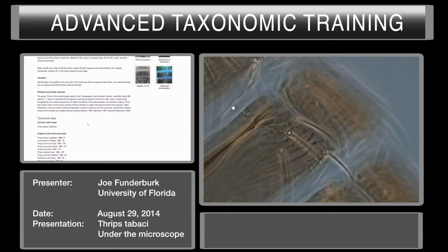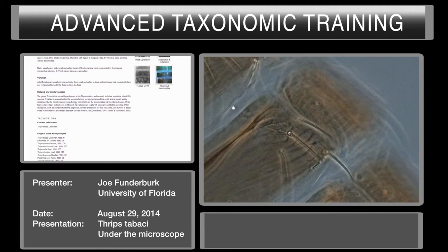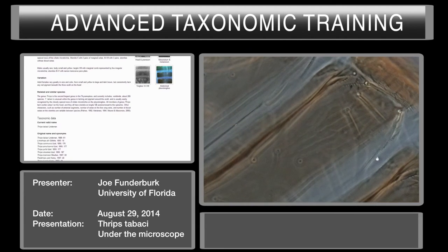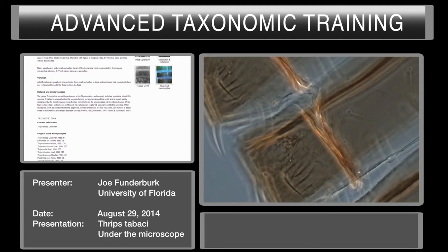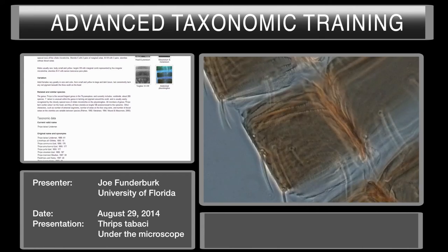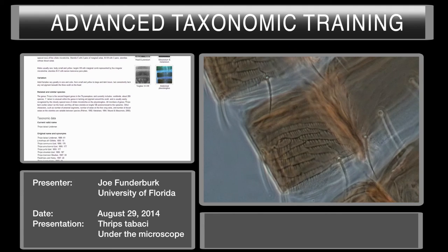It also gives information about related and similar species. You'll notice it says that Thrips tabaci is unusual within the genus in lacking red pigment around the ocelli, and is usually easily recognized by the closely spaced rows of ciliate microtrichia on the pleurotergites. So let's look at the pleurotergites and focus up and down — there you go, regular rows of microtrichia.